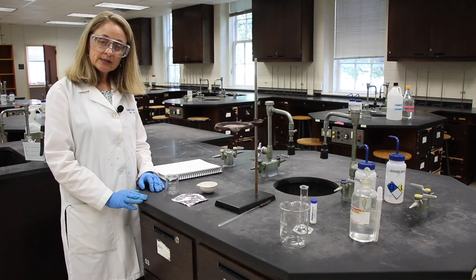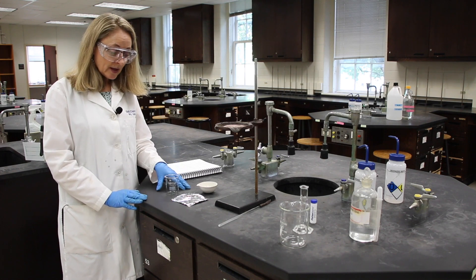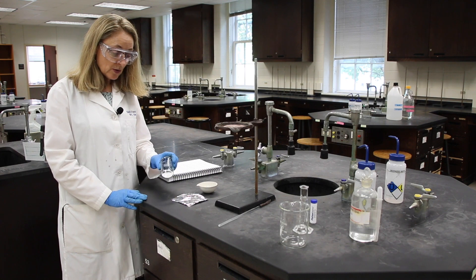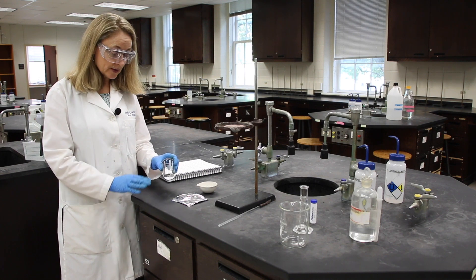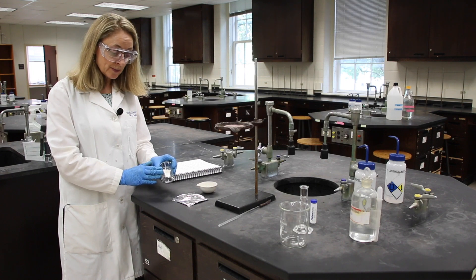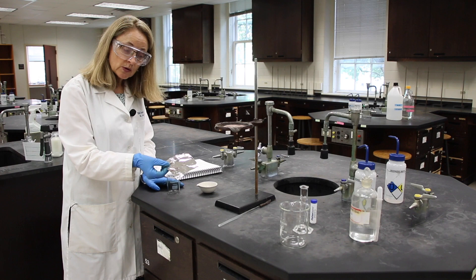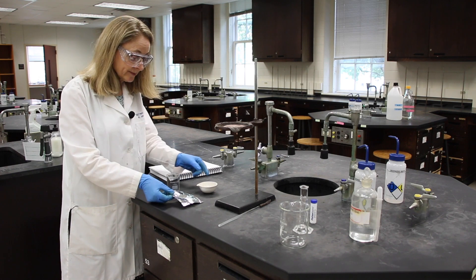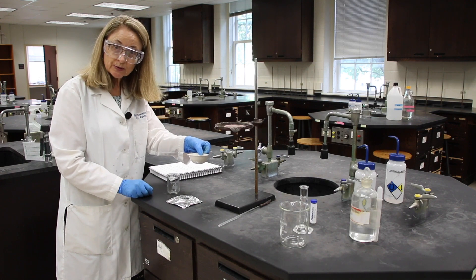The first three steps are a lot of weighing. First, we'll need to weigh some copper chloride dihydrate, which is in the back balance room, and put it in our beaker. We'll also need to weigh a square of aluminum foil and our evaporating dish. Let's go to the balance room.